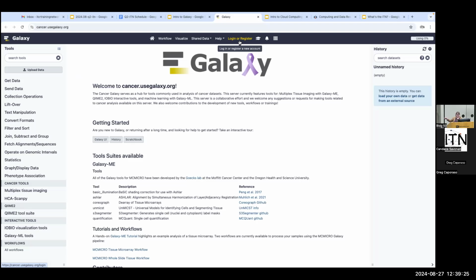And here what you'll see is on the left, we have that tools pane I told you about with the searching available and an upload data button in the tools pane. It's a little bit different from Main. Main has a secondary panel over here where upload is, but that's all right. This is really close to it. And then this is your main information.